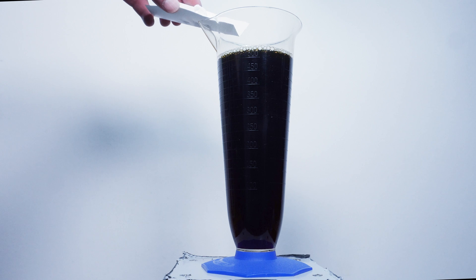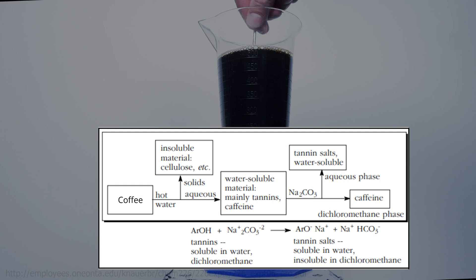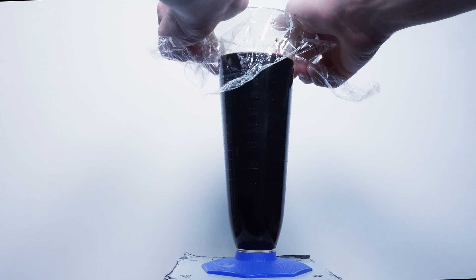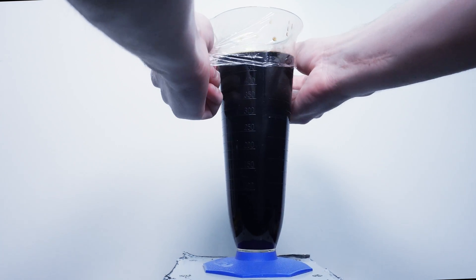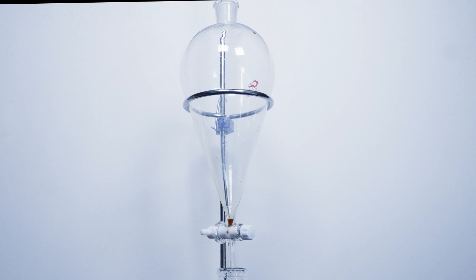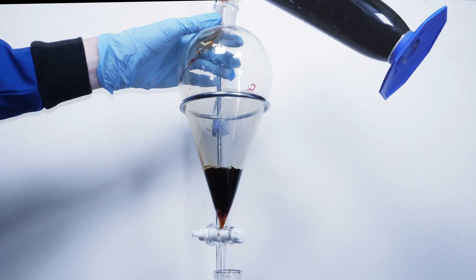Following this I added about one gram of sodium carbonate and stirred it really well to make sure it was all dissolved. This deprotonates the phenolic group within the tannins making them more soluble in water and less soluble in DCM, which I will be using in the next step. The tannins can be why caffeine extracted from natural sources can be tinted brown if they are left behind or the caffeine isn't purified after the extraction. From here I wrapped the container in plastic and put it in the fridge for it to reach 40 degrees Fahrenheit. This will allow the caffeine to become less soluble in the water without falling out of solution.